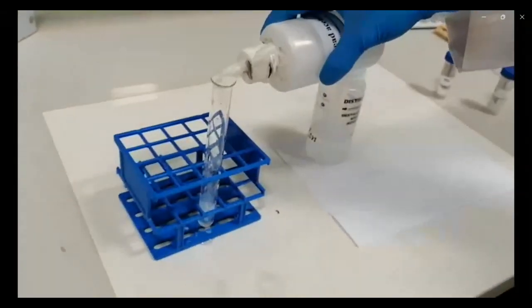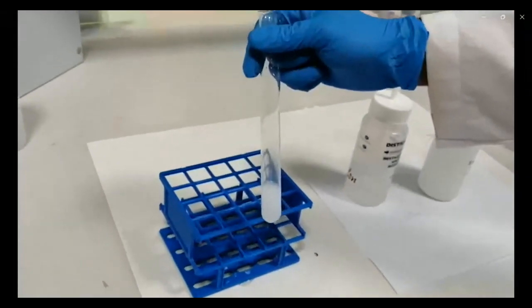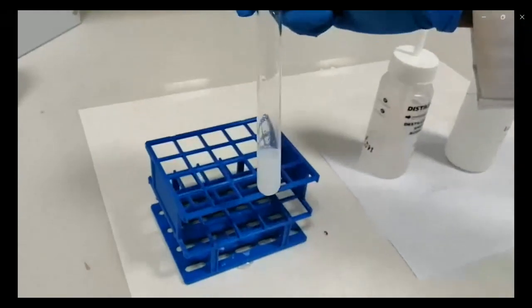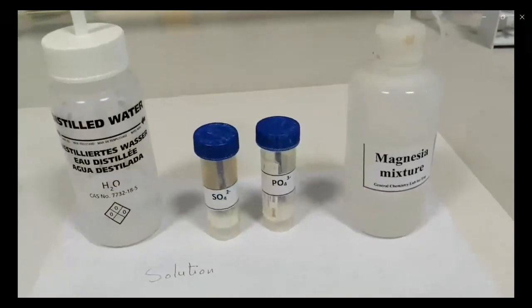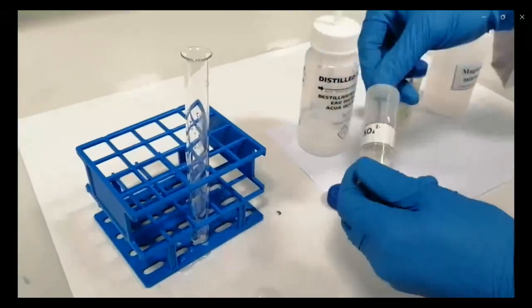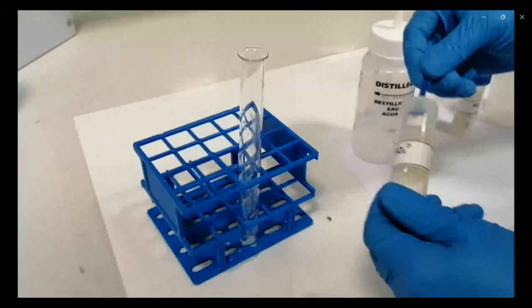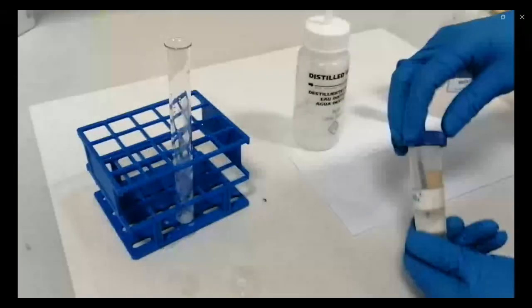You will see a white precipitate formed, so you cannot use that confirmation test to differentiate between sulfate and phosphate. The most important test for phosphate is the magnesium mixture. You can identify the phosphate by that test.